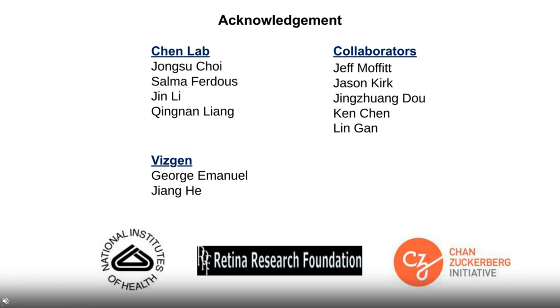So the cell boundary antibody conjugate, we actually receive directly from Rui Chen, and they have 3 different types, and then we use all of them at the same time. I think in our case, the second one, channel 2, works the best, but not for all the layers. So I do think it depends on the tissue. Maybe a different type will work better, or sometimes you probably need to use a combination.